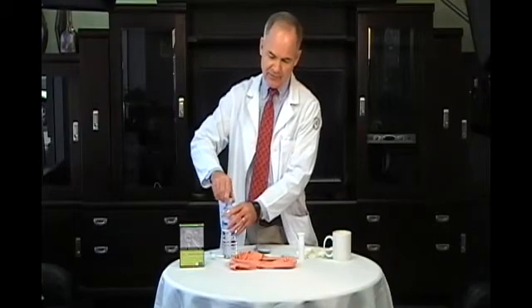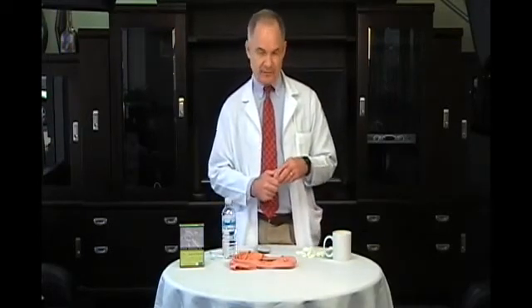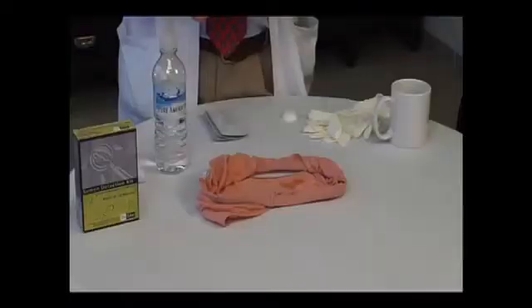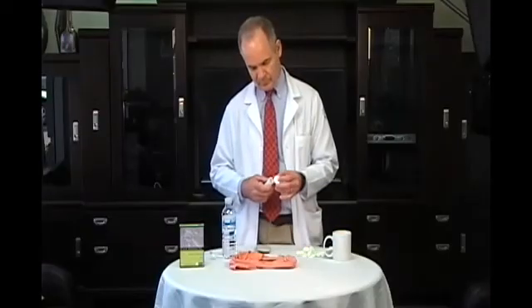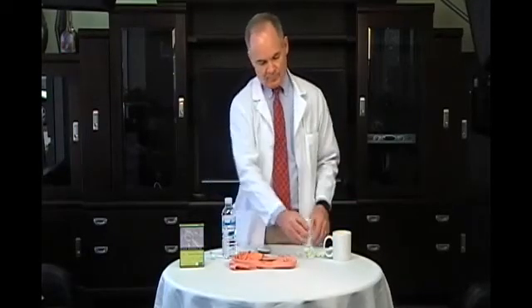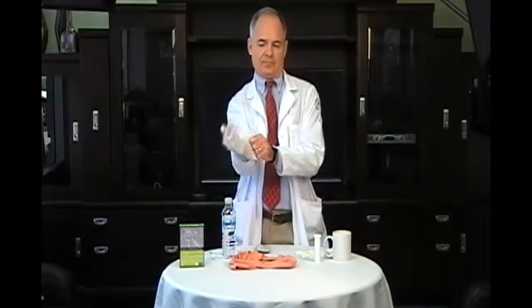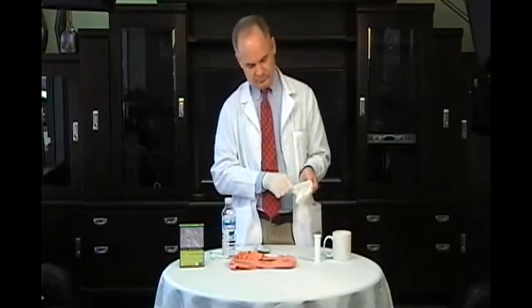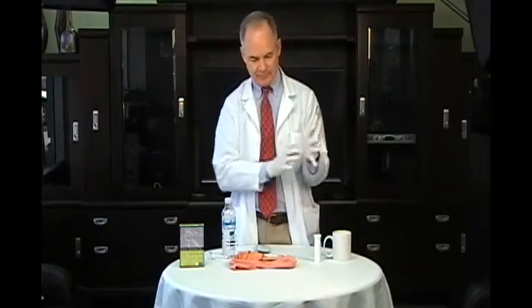Now, I'm going to let that soak in for about 60 seconds to give the material inside the fabric time to dissolve. And then we're going to do a test, an acid phosphatase test. These are what the test strips look like. Now, since we don't know where this garment came from, we want to use gloves. Like this.